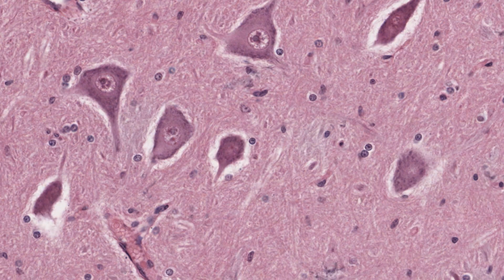This is grey matter in the spinal cord. All these nuclei are stained with hematoxylin because the heterochromatin and also the nucleoli contain ionized phosphate groups in the nucleic acids.